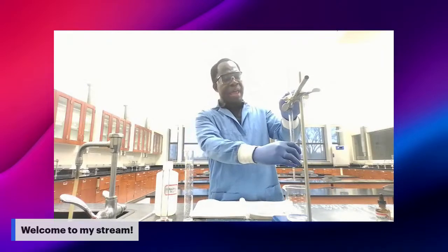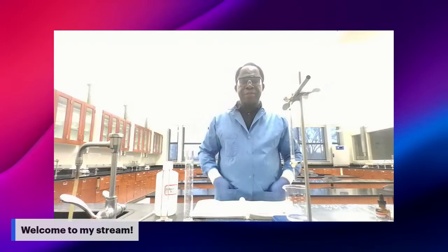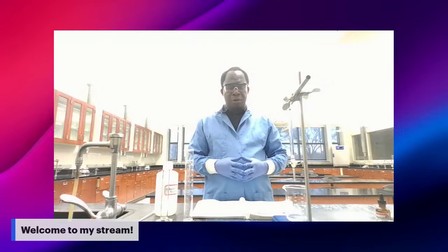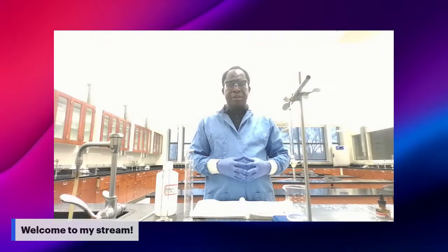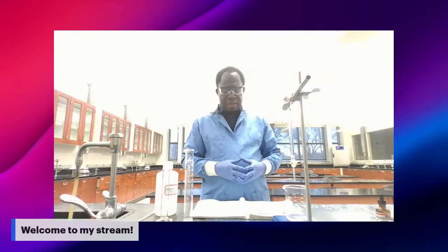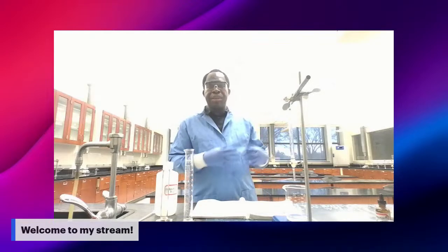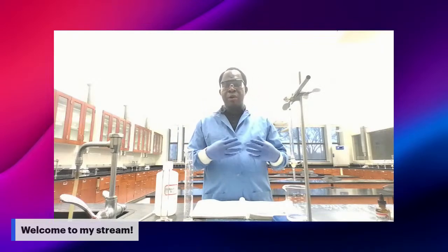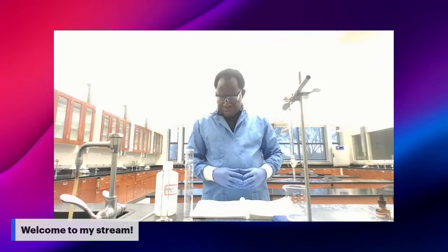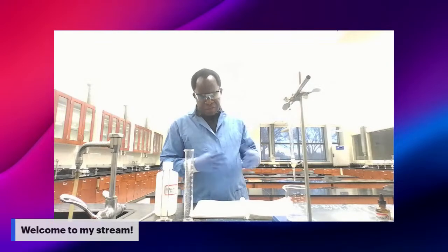By the end, you're going to have a series of data that will help you draw your titration curve, and from there you can determine the pKa, the volume of NaOH at equivalence, the Ka of your unknown acid, and the half equivalence.